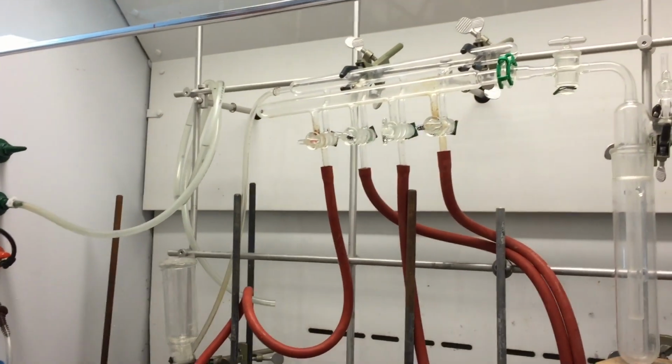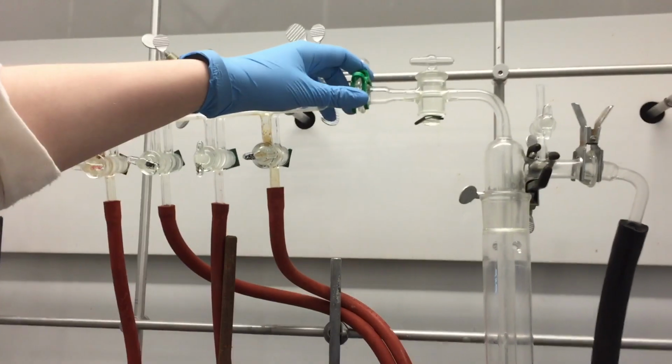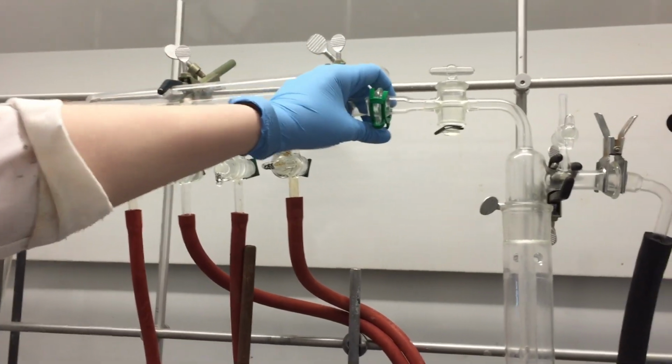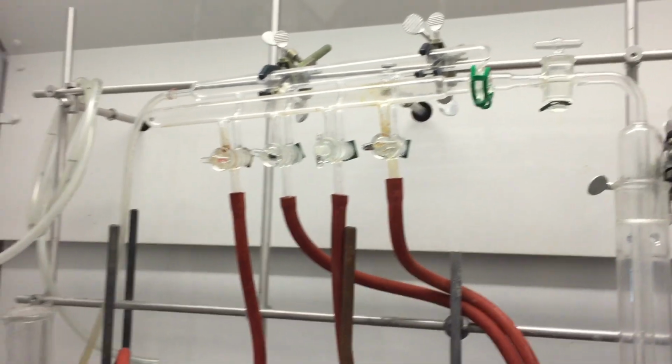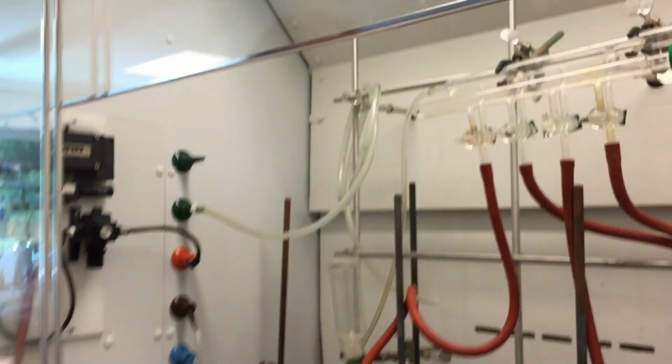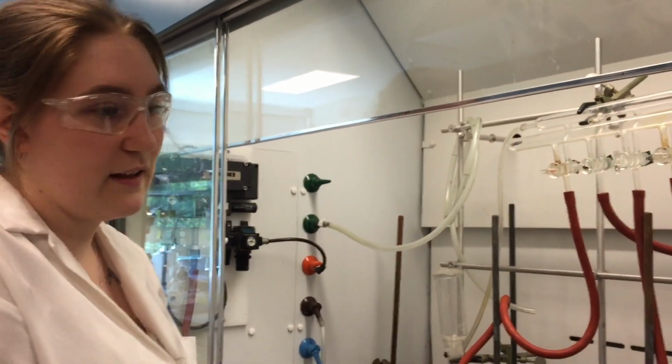So the first thing that we're going to want to do is, of course, make sure that all of your joints are greased well and everything is attached properly. This is really important because you don't want air to get into the Schlenk line while you're doing this, because you could make liquid oxygen, and that's very dangerous.